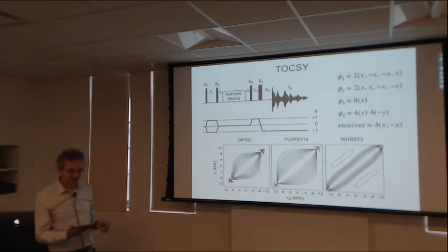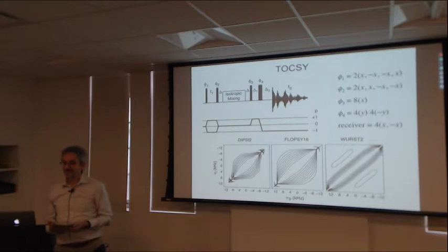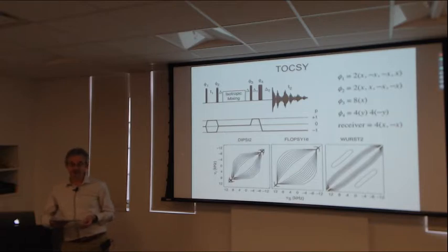And now, with numerical approaches that come from what's called optimal control theory, that was brought into NMR by Skinner and Glaser, the numerical outputs are completely unrecognizable. The sequences just look like bursts of noise, but they have the range properties that one wants.